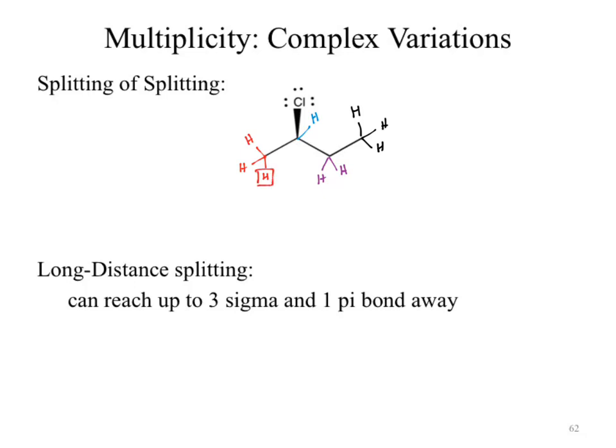Chemical shift: less than 2. We might predict less than 2 because that's our standard range for our alkanes, and we know that because we've memorized that information. It is kind of close to that chlorine being nearby, so it might shift to the higher end of that range, but it's still probably in that less than 2 range.